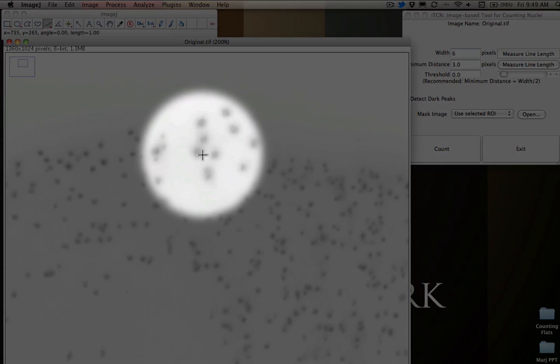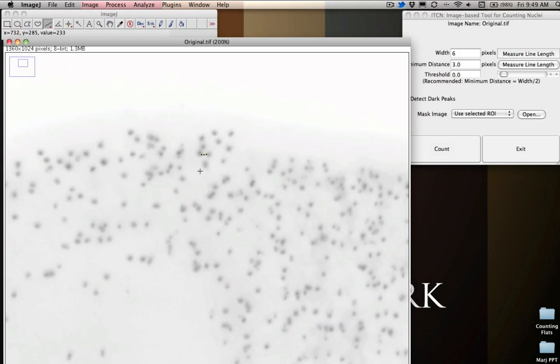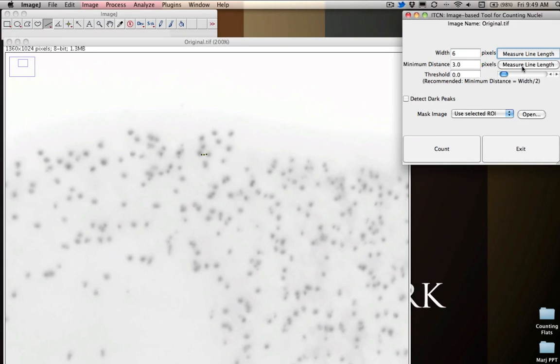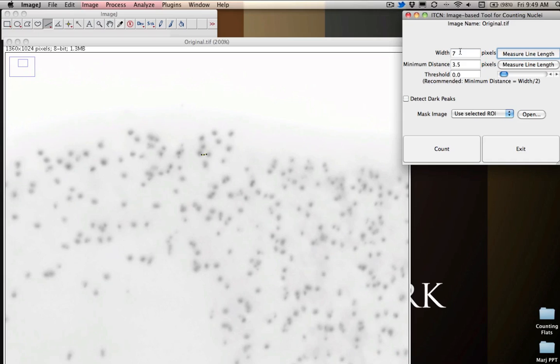So we would do something similar. We'd find a fairly representative area where the nuclei are close together. We would say measure line length. It gives us 7. And then we would have to give it a threshold so that it knows how much it should tolerate differentiation between all of the different samples. Now I've experimented with this a fair bit. So I can tell you that the numbers that you really want to use here is you want to say 7 pixels. Down here we want to say 2.5. And then finally for the threshold, we're going to set the threshold at just 2.